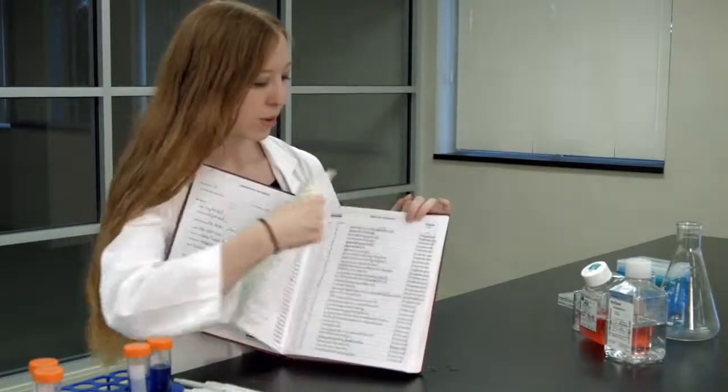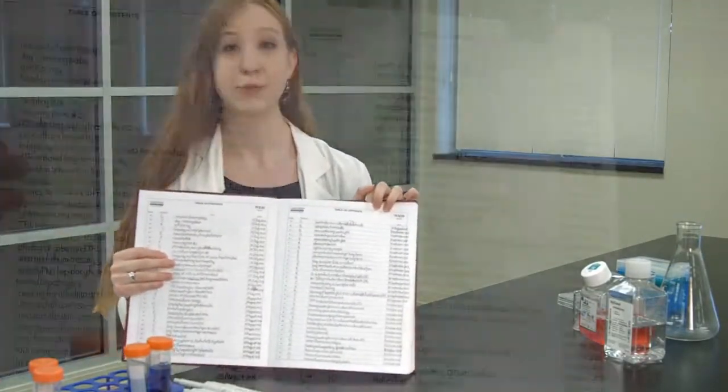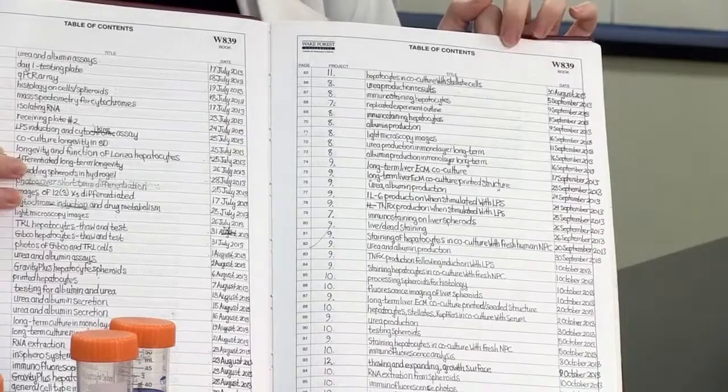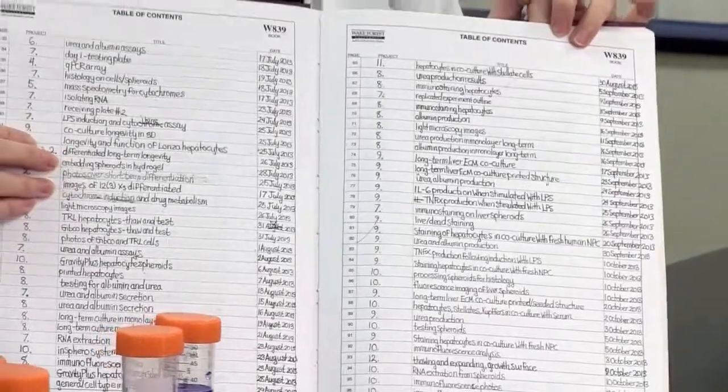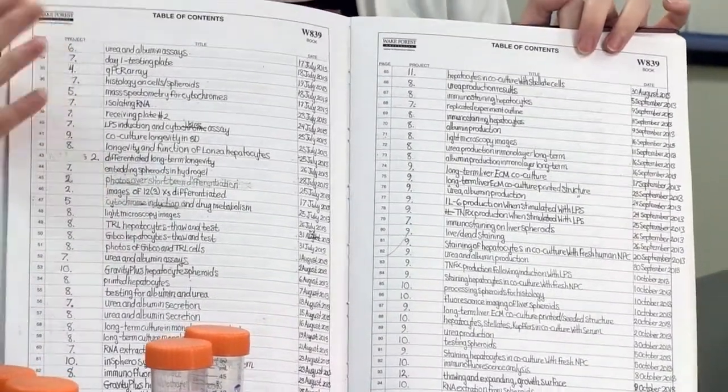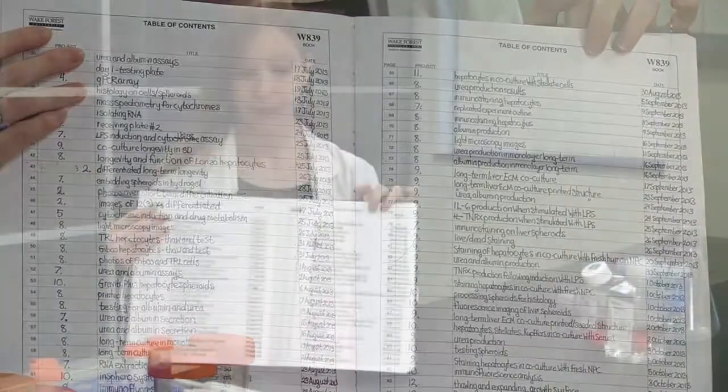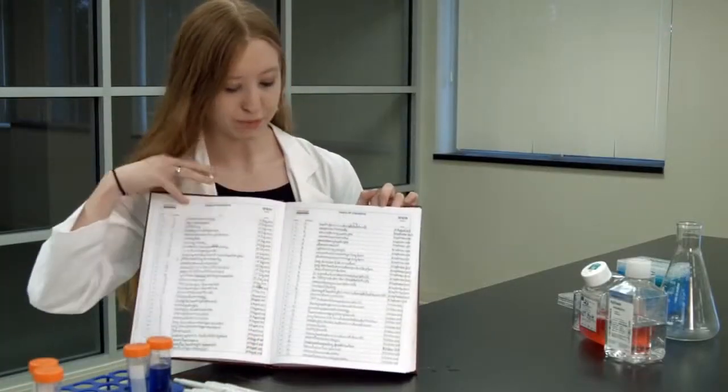What I would argue is the most important thing of a lab notebook is your table of contents. It takes a little bit of extra time to do, but it's really helpful when you're trying to look back to a past experiment or technique and you need to find it quickly. It also helps you keep very organized.